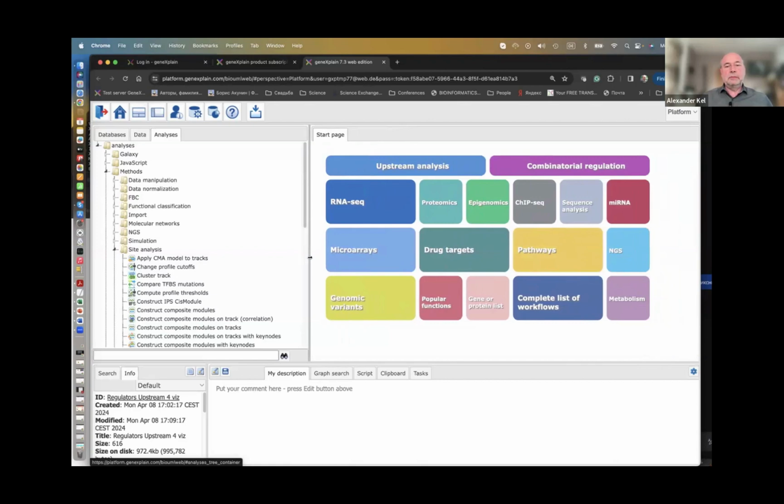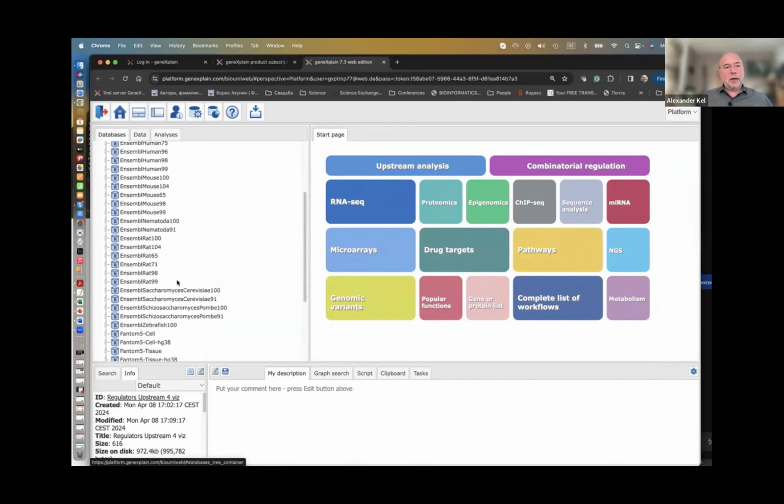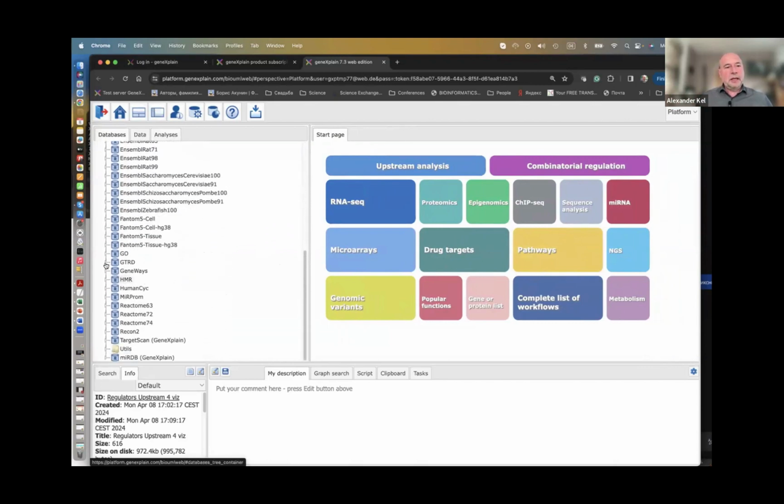Of course, you can also see what can be found in a first sketch, before perhaps becoming interested in particular transcription factors and diving more in depth. And for that, you may need bigger libraries. We have a small library available here for everyone, located in this GTRD folder.